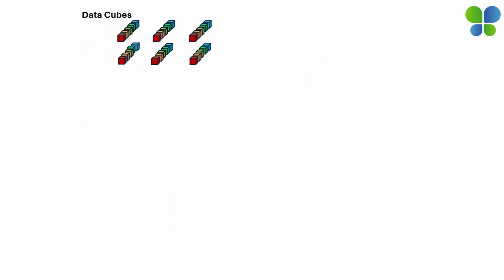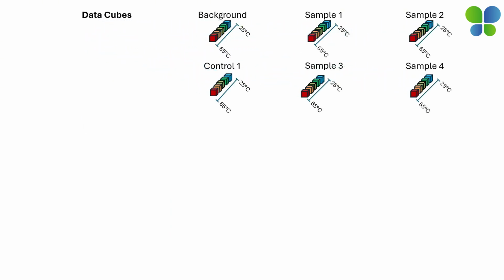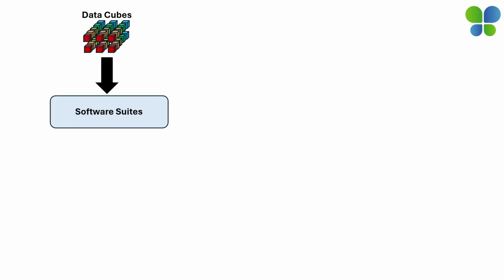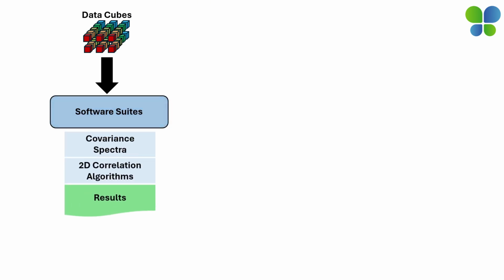Multiple attributes may be monitored due to the high sensitivity and selectivity of infrared microspectroscopy, which is expanded to an array of preclinical candidates in the form of the series of data cubes. The hyperspectral images allow for true multiple critical quality assessment of an array of proteins in their formulation condition. The analyst can activate the dedicated software suite, and a quantitative report will be generated within minutes of the request.